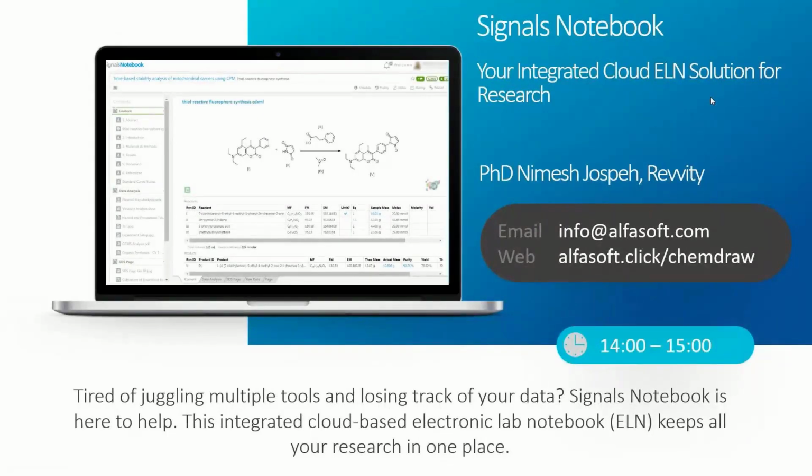Okay, thank you. Good to know. One last question for you before I leave you. How does Signals Notebook support collaboration with CROs? I think that's contract research organizations. That is correct. Yes, yeah.